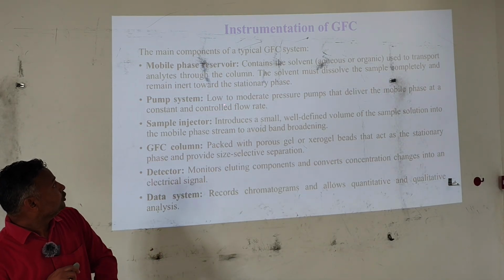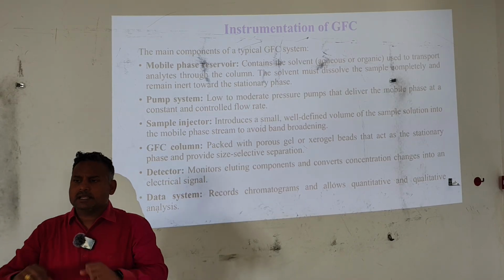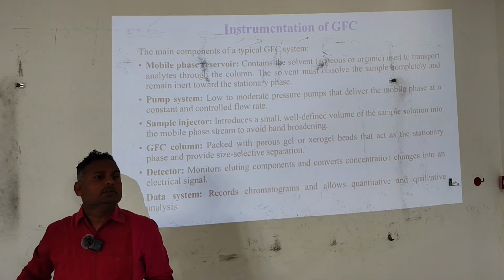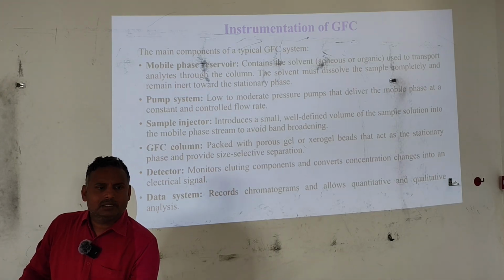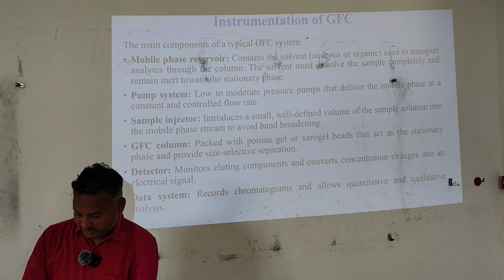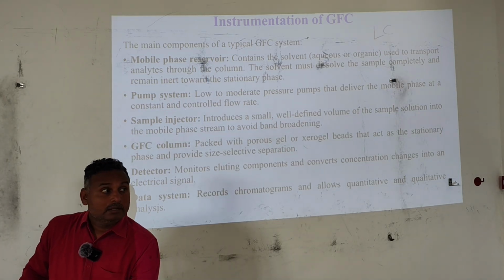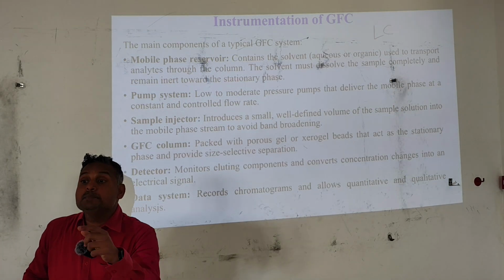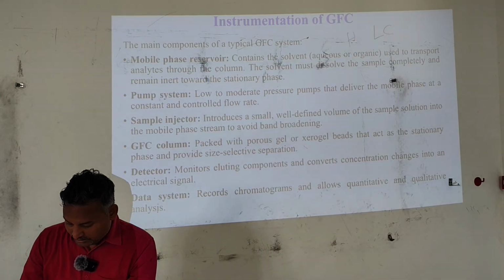Pumping system. Low to moderate pressure pumps. Because here there is pumping of the solvent. That's why this GFC is nothing but HPLC. It is liquid chromatography, isn't it? And the performance of the technique is improved by the pumping system. This is nothing but HPLC.